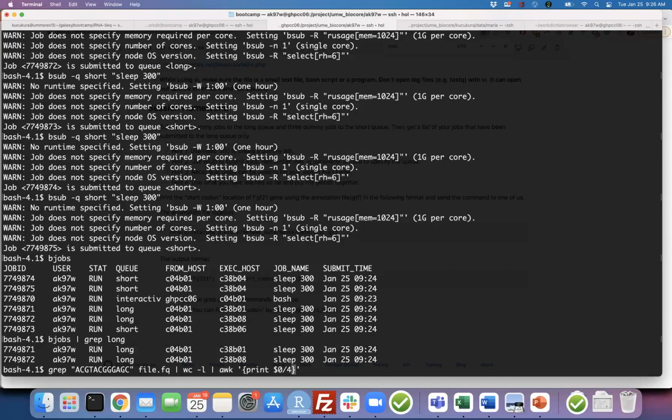Otherwise, she wouldn't. Okay, so sometimes these kinds of commands are going to help you do your own checks. That's why I learned them. But usually in that case, I was using exact match. In the future, you're going to allow some mismatches while mapping. But even if you allow mismatches, those mismatches will be only 1% or 2% of all that sequence that exists in your FASTQ files. So when you grep, you should get a huge amount of those reads in your files. So you can try that.